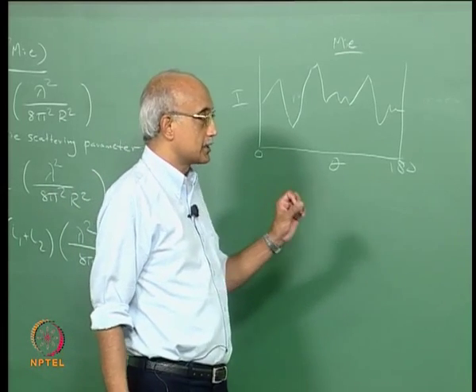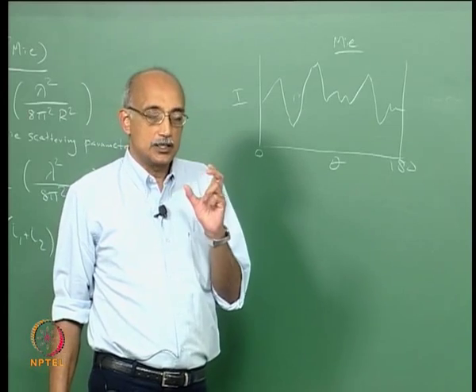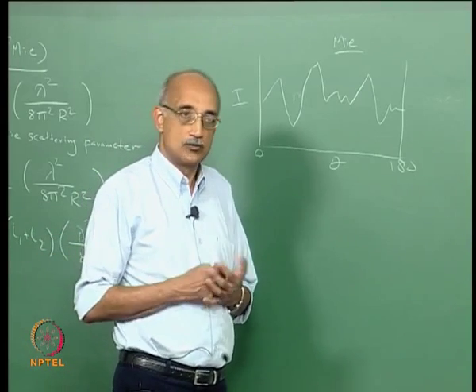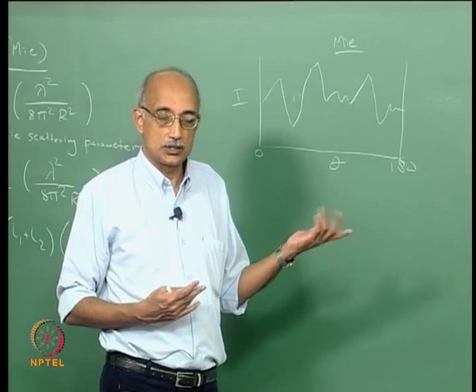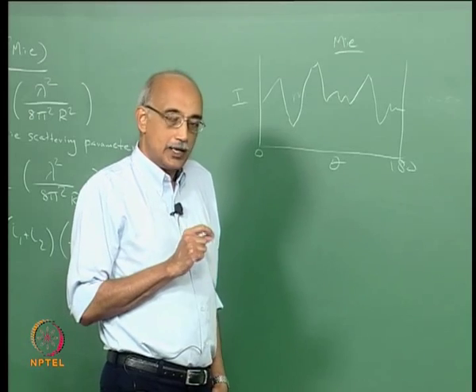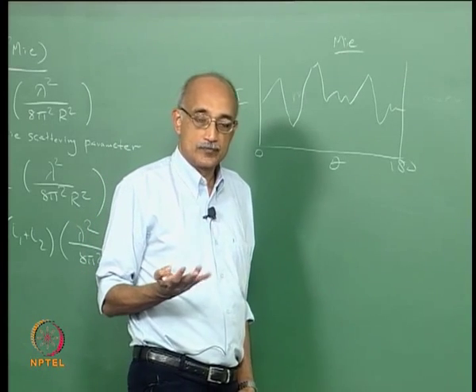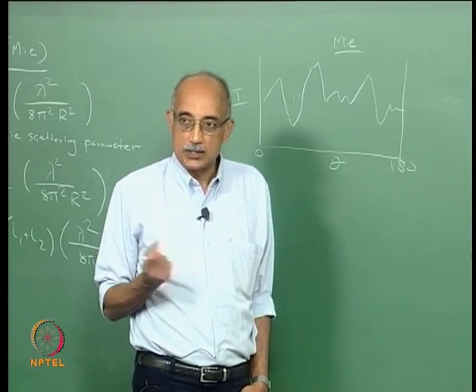So, for particles that are roughly in the 1 to half a micron range, the uncertainty in the measurement is very high. For particles that are larger, again you can go back to optical methods of analysis. For particles that are smaller, you can use the Rayleigh scattering calculations. It is the particles that are in the range where they are too fine to be characterized using conventional optics, they are too coarse to fit into the Rayleigh regime, that the uncertainty in the measurement is highest.